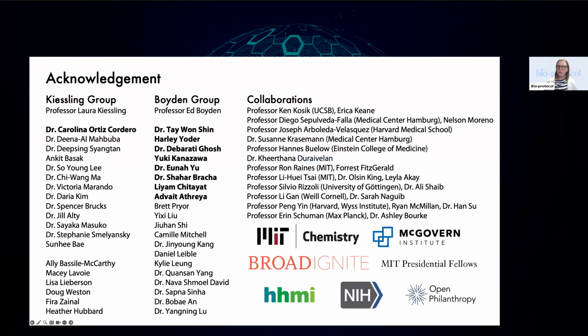Cool. Has anyone tried to visualize centrioles and flagella or cilia? I know that there have been groups using expansion to look at centrioles and flagella, but we didn't do that for our paper.